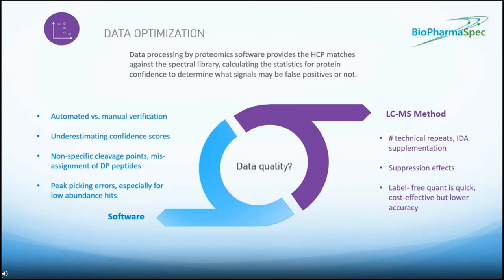And then finally, I've got a point there just so that I make a note about our reliance on automated data reviews. It's simply a consideration that there are advantages to carrying out manual reviews in order to supplement the automated hits. Algorithms won't catch everything because of the challenges of interpreting data over, sometimes, up to 5 orders of magnitude sensitivity range.